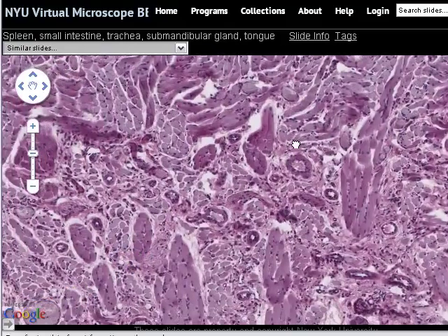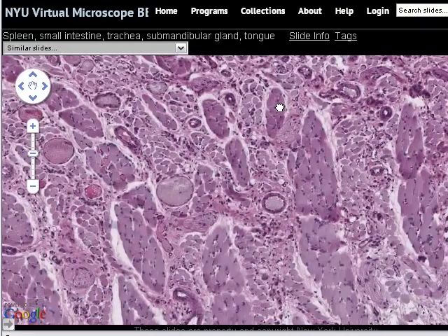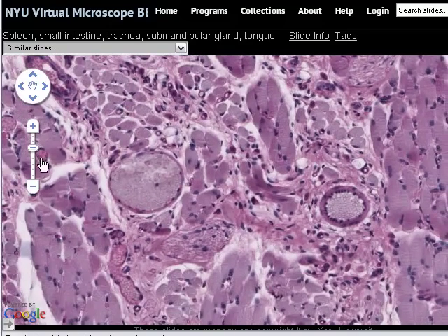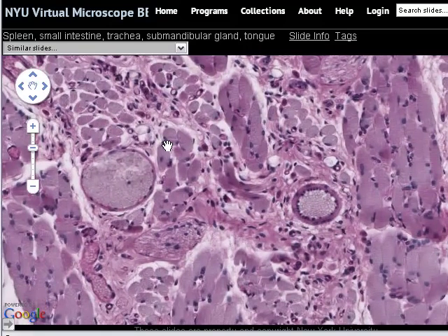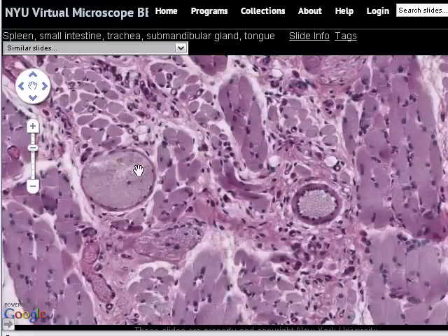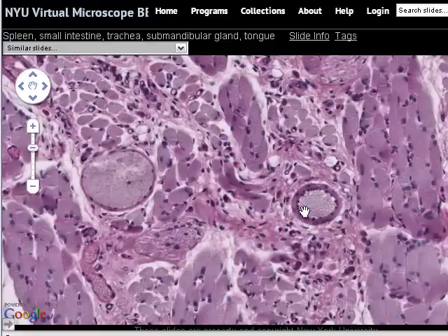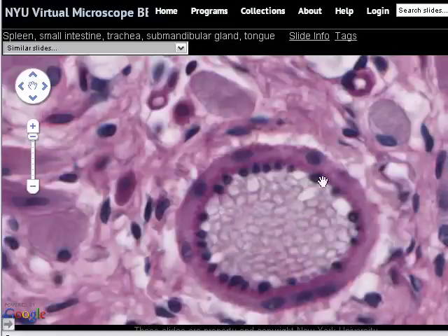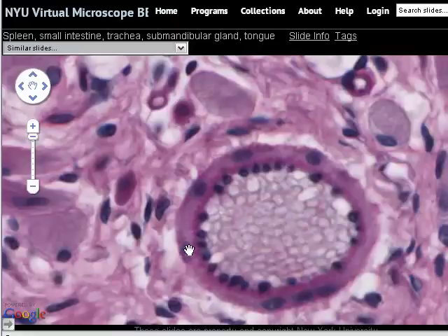If we move further into the core of the tongue slide, we can see some other blood vessels. In this image we have some venules and an arteriole. This venule here is filled with little red blood cells, and this is an arteriole here. In this practical you're not expected to learn the difference between arterioles and venules — we're just looking to see the simple squamous endothelium lining them. Here's the arteriole; the endothelium lines the lumen. Outside of the endothelium there's a layer of a special kind of muscle, quite elastic in consistency, and when tissue is preserved it often contracts.